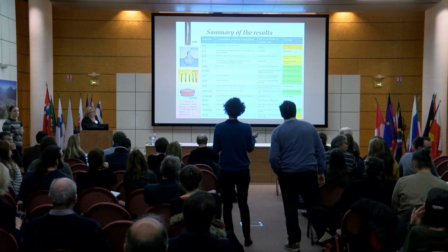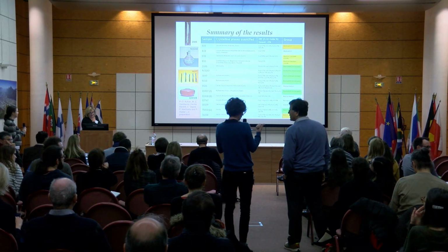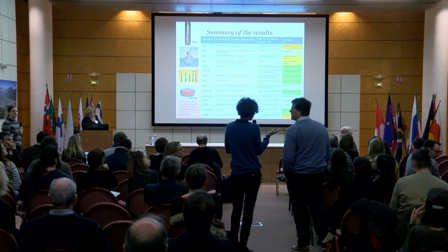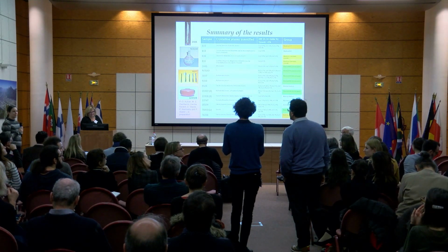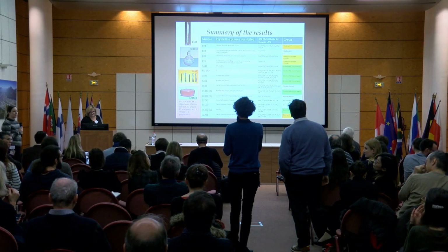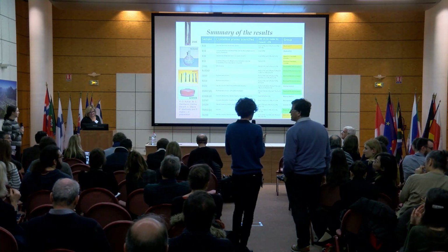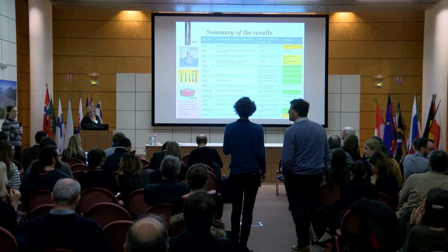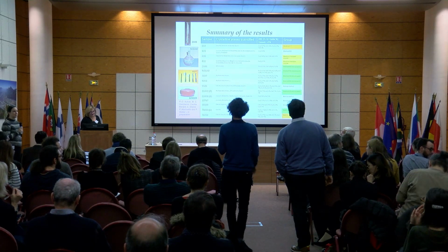This lead calcium phosphate. And this result for us is very interesting because when we found lead and phosphorus as lead phosphates, not on the, or possibly on the Herculaneum papyrus, but on Egyptian papyrus, immediately the first question is: is it something which forms in situ? Because of the phosphorus which will come from the environment. The fact that you find it in the ink independently of the papyrus is a very good clue that phosphates are already in the ink and they are not coming from the environment. So I think there is really something to explore more on this kind of phases here.